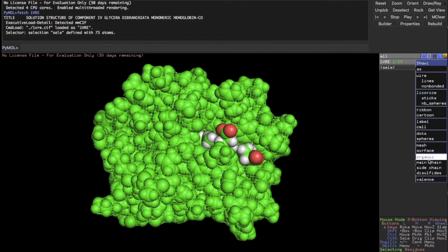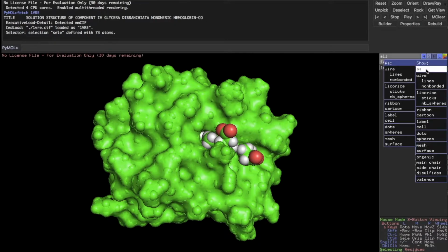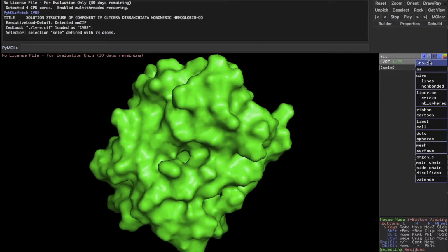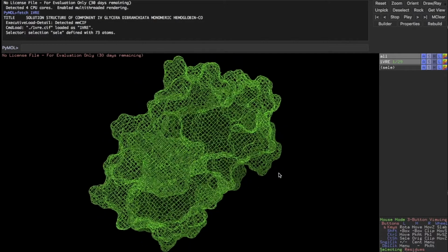So what I want to do is, instead of continuing to show all of the layers on top of each other, surface is taking a long time to generate as well, because again, I've got so many layers pulled up on my program. There it is. What I want to do instead is do show as, and so if you do show as, that clears all other layers except for the layer that you asked for. So now I'm just seeing the surface layer. I'm going to show as mesh, and now I'm just seeing the mesh layer.